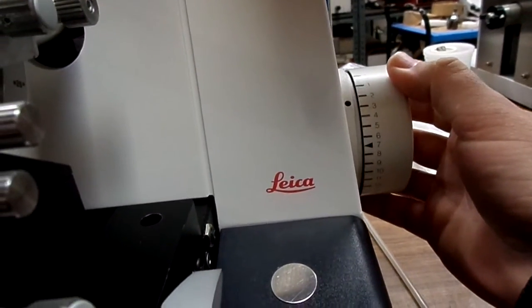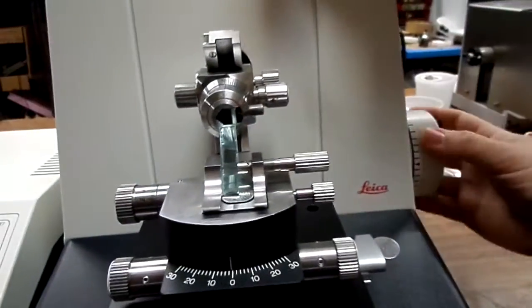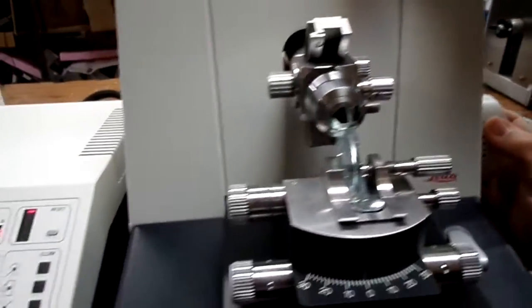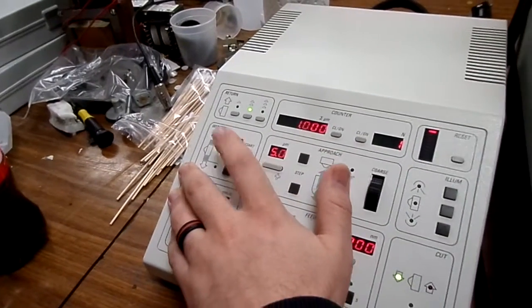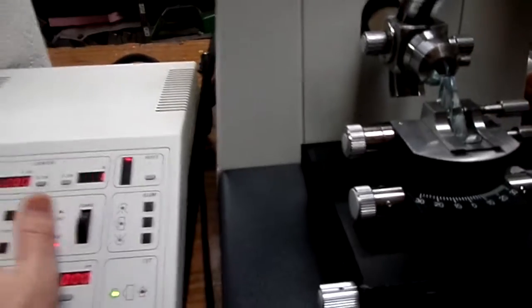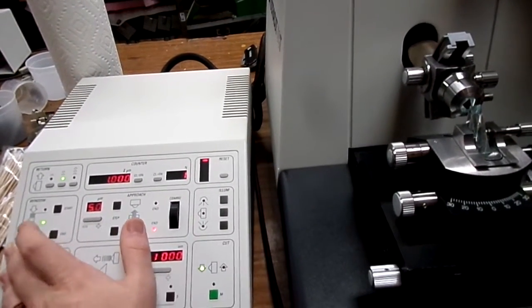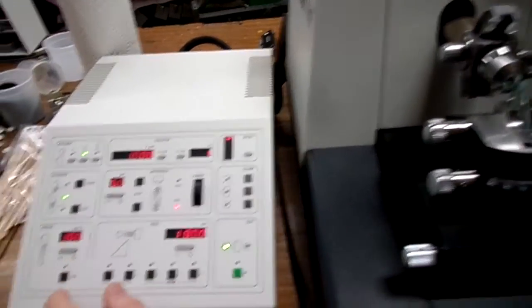So you would watch the specimen as you're turning your hand wheel, and you'd get to the bottom of the specimen. Then you would hit your cutting window start button. Then you would go to the top of the specimen and hit your end button.